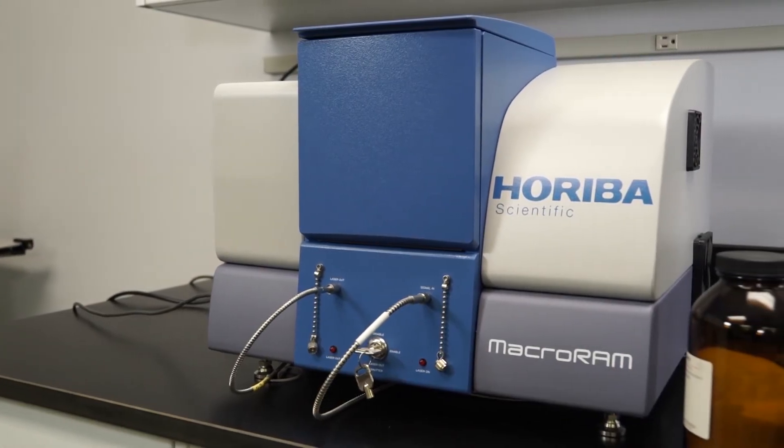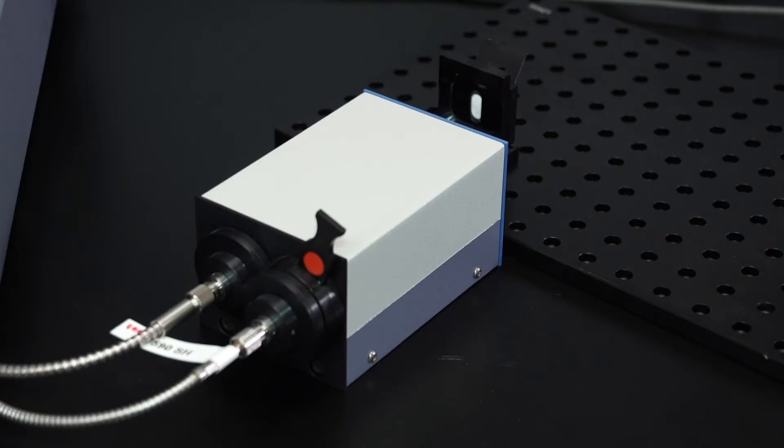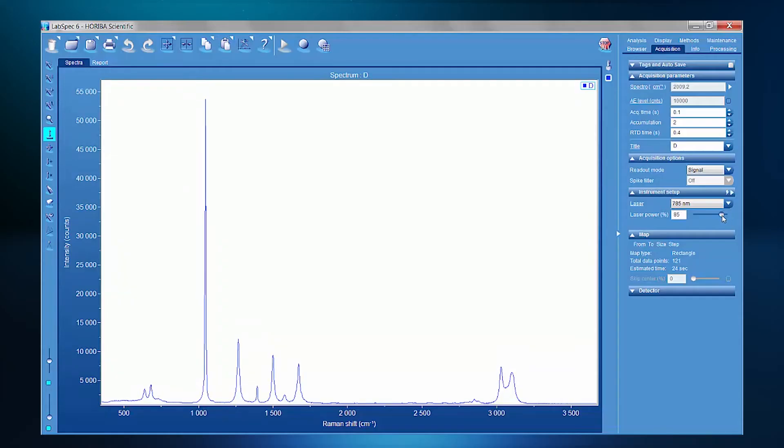Equipped with a high-power 785 nanometer laser, tunable to 450 milliwatts. Near-infrared excitation suppresses background fluorescence from the sample.